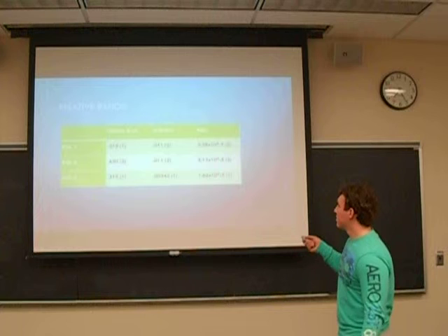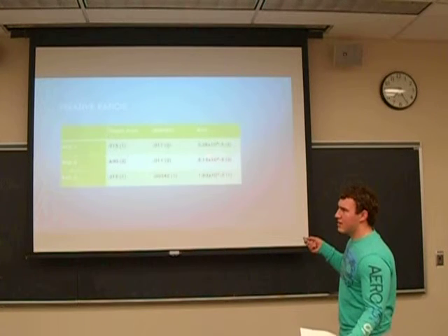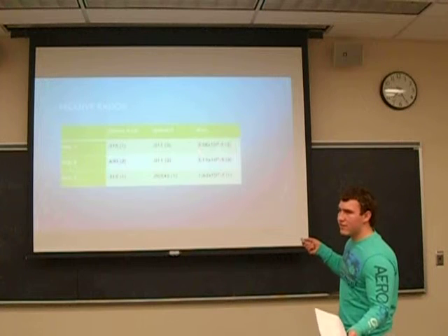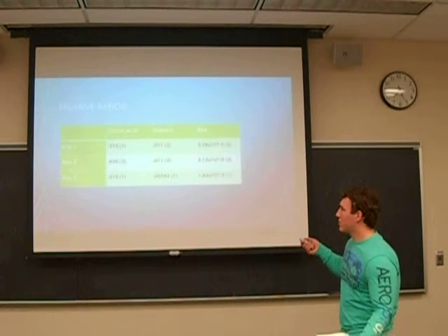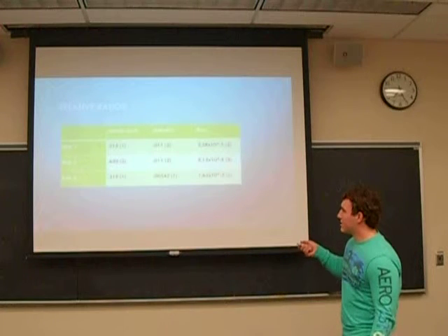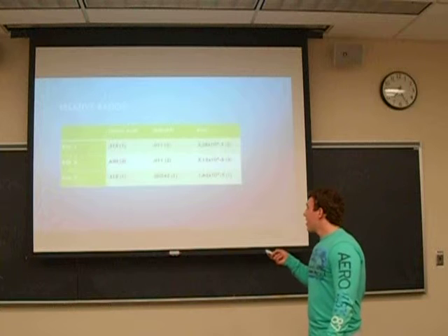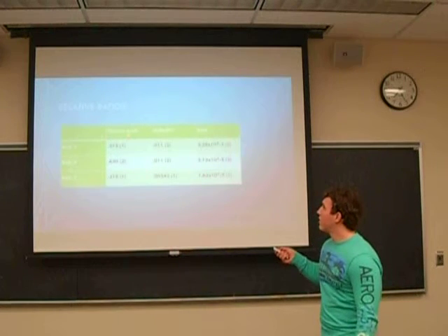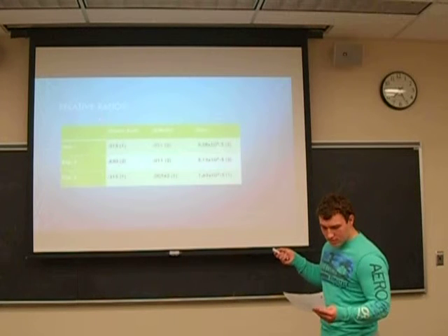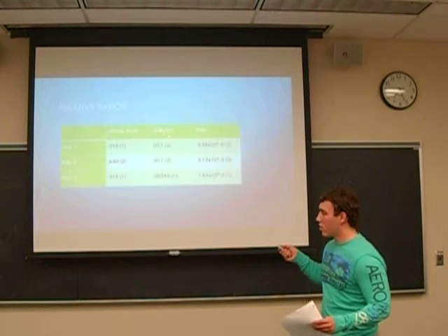This doubles. It's not quite doubling, it's a factor of 1.56, I want to say, which ended up giving you 0.7 as an exponent. And as the other was held constant, this doubled as well as this doubling, so it is still a 1. Because of that, you would get an order of 0.7 for the oxalic acid, and for the KMnO4 you got 1.